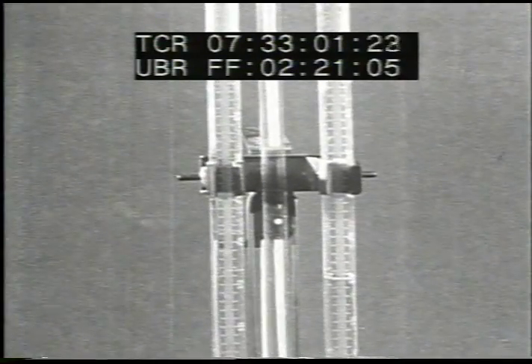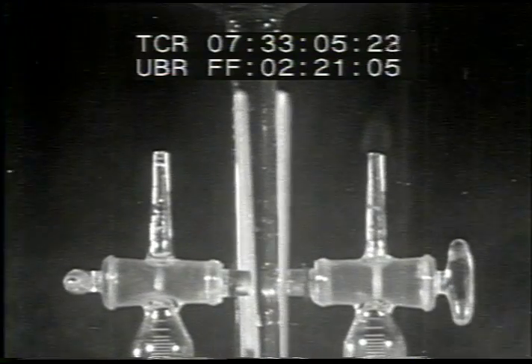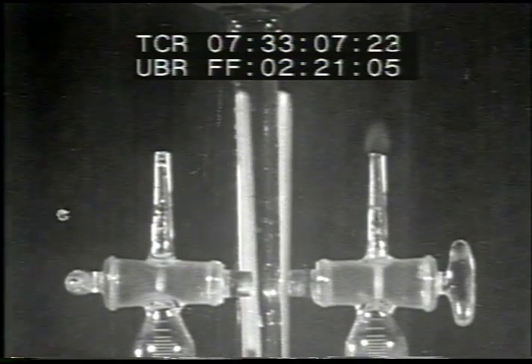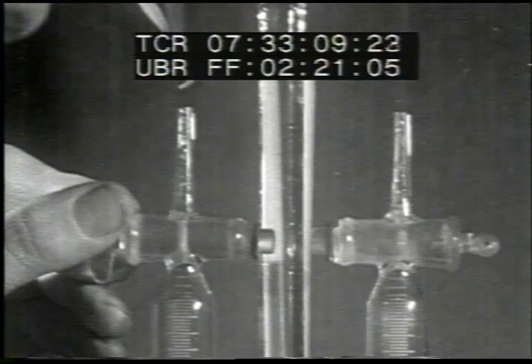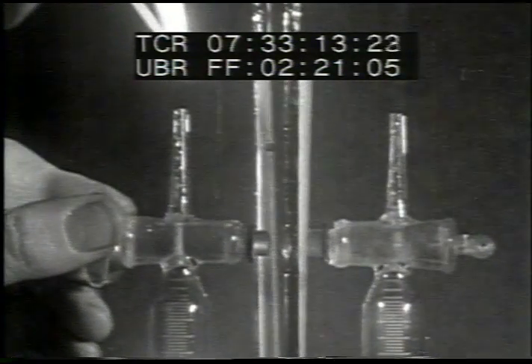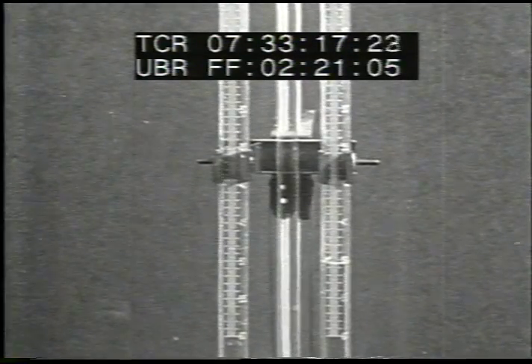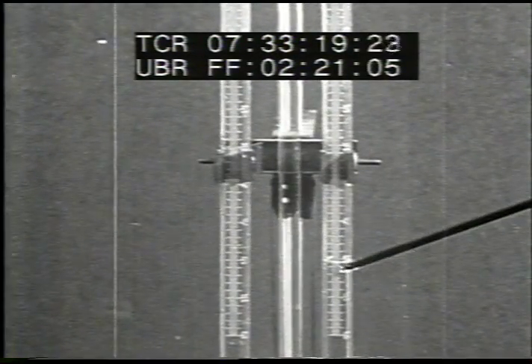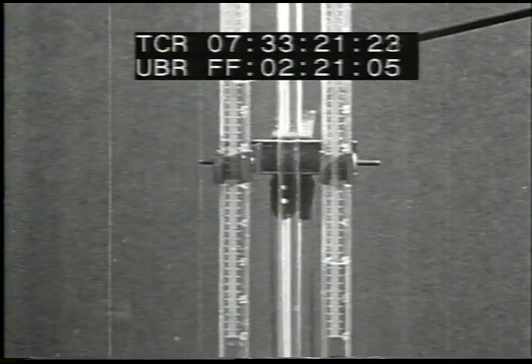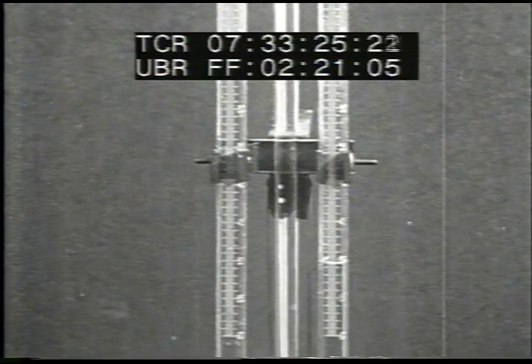To increase conductivity, volume of gas formed at the negative electrode burns with an almost colorless flame. This gas is hydrogen. The second gas formed at the positive electrode causes a glowing splinter to break into flame. This gas is oxygen. You must remember that the 2-to-1 ratio of hydrogen to oxygen, as shown by this experiment, is only by volume and not by weight.